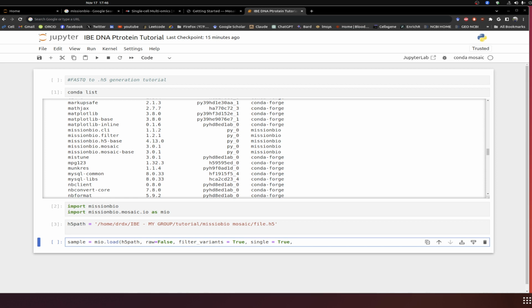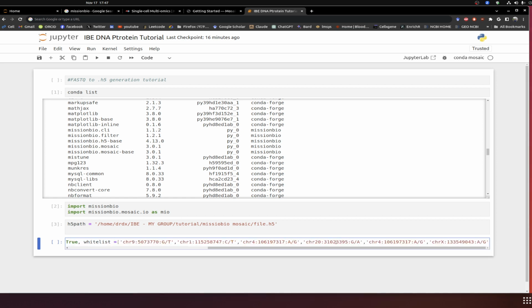So to do so, you can specifically define, okay, I want this filter to be added. Like you can add it like whitelist, but it's not always necessary. Most of the time we define it later on. You load all of those and then you define, okay, now I don't want them. So that could be another thing. I would suggest, think about it. It's not an obligation or anything, but you can always run with this. So either way, that's all right. So for example, this is the list of the variants that I want. So I add it up like this.